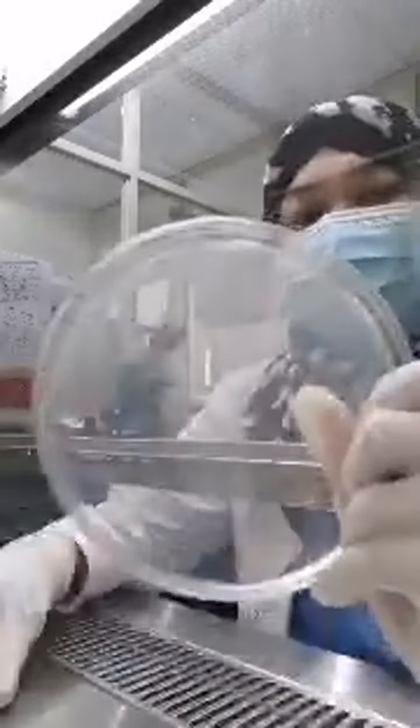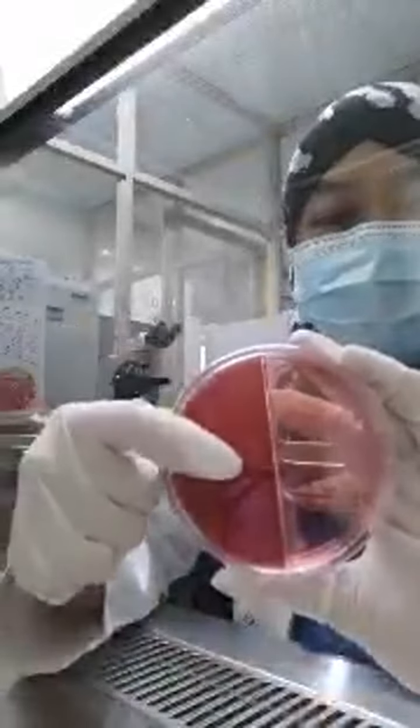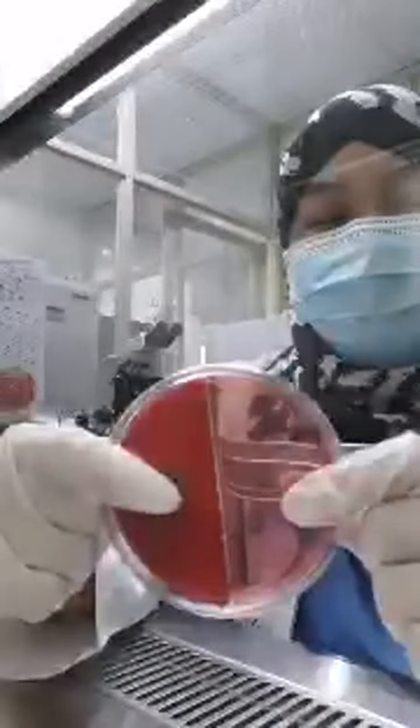And MHA Agar for sensitivity, culture and sensitivity, for the antibiotics. This one is for all. Use this for urine culture, for stool culture, for any culture. This side is the blood agar, and this side is the MacConkey.